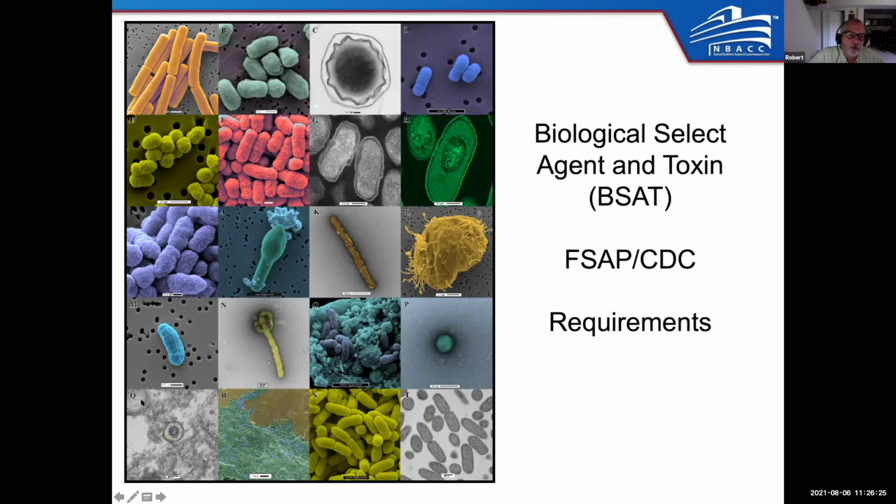So if you look at Q, this is the cytoplasm of a tissue culture cell in gray. In green right here, you have a lipid vesicle that contains what we now call the SARS coronavirus 2. In blue, you have the viral core, and in yellow or gold, you have the viral spike proteins. So this is the SARS coronavirus 2 inside a cell.